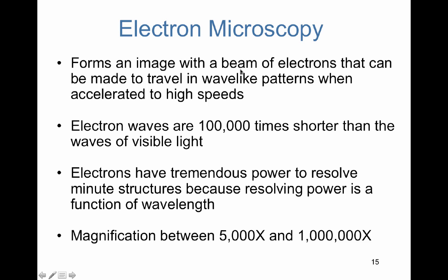And then we are moving on to electron microscopy, which has the greatest resolving power and the highest associated magnification potential. Unlike light microscopy, where we said you could magnify an image up to 2,000 times its actual size, check this out, it goes up to potentially 1,000,000 times the actual size. So we can use electron microscopy to see viruses, which are much smaller than your average bacterium.